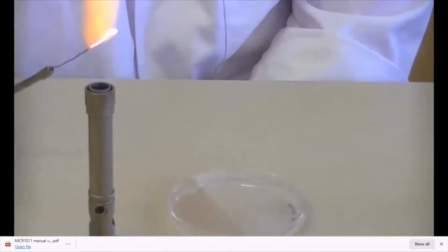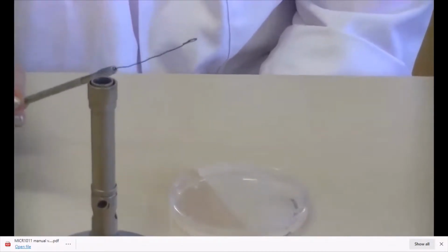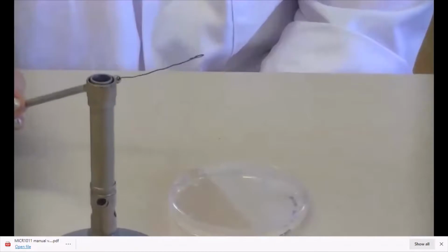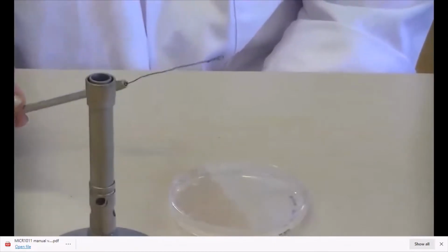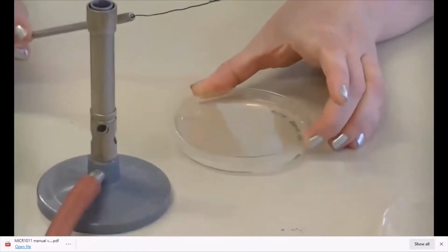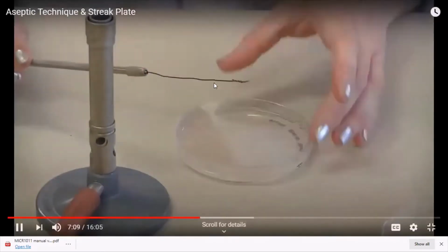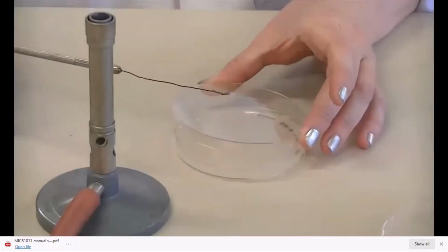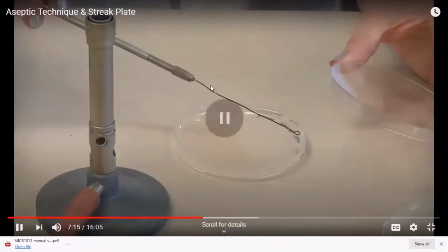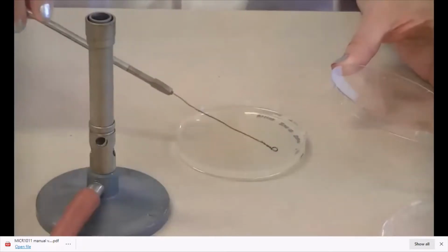Once you've transferred it, you need to flame your loop again to ensure that any excess bacteria is removed. Remember, the purpose of the streak plate technique is to dilute the cells, so we're removing any of the cells that might have been on our loop. You need to make sure that you turn the plate so that you can perform your secondary set of streak lines. They must intersect with the primary ones. Turning the plate helps you to remember that you need to intersect them. We usually turn the plates at about a 45-90 degree angle. That's how we usually drag the loop across the surface of the agar, this time lifting it off at each of the strokes.